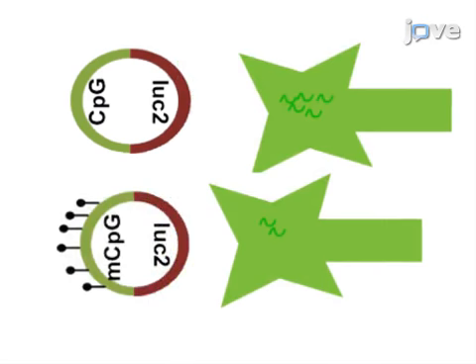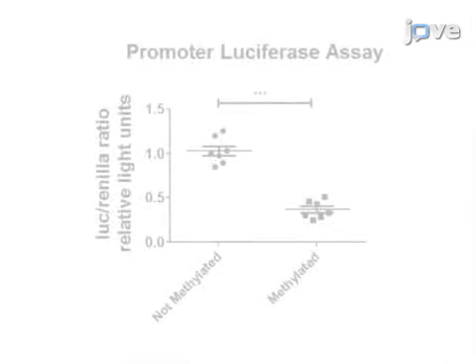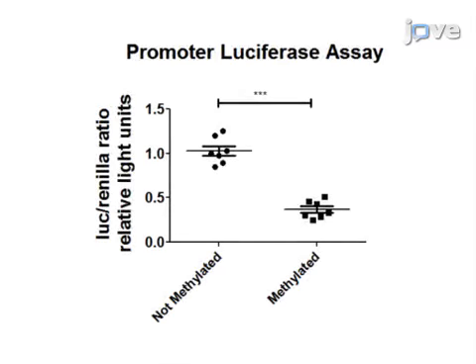promoter with transcriptional activity. Ultimately, MS-HRMA and the luciferase assay are used to measure the DNA methylation status of KCNJ10 and correlate changes in the methylation of the promoter and transcriptional activity of the gene. Demonstrating the procedure will be Sini, a postdoctoral fellow from my laboratory.